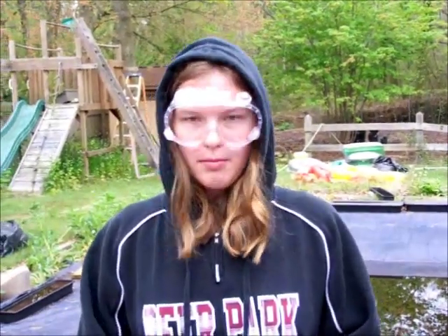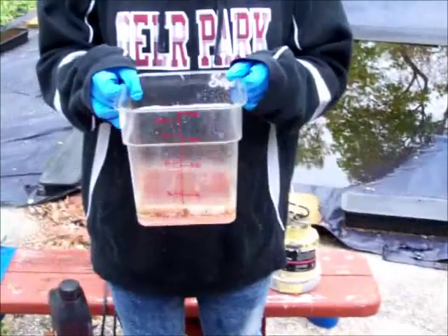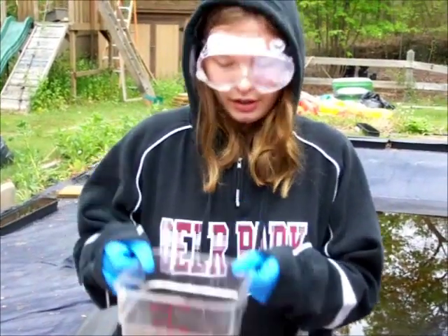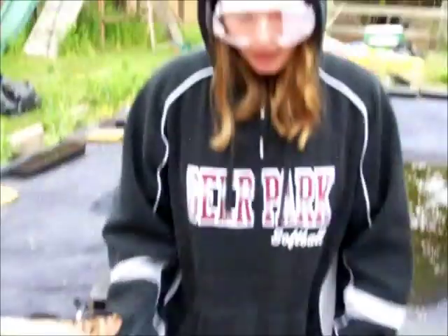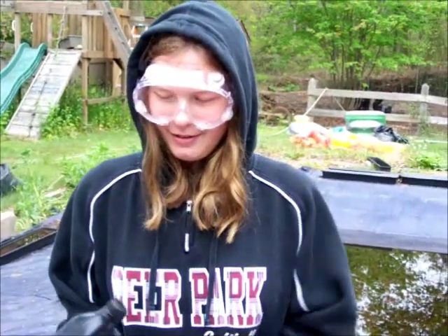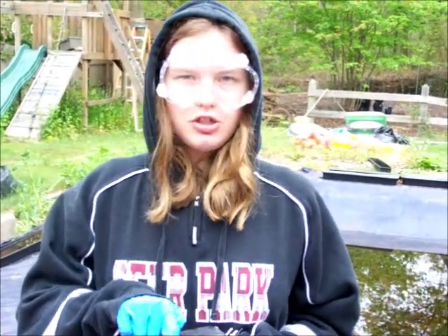For the purposes of this experiment, we're going to do it in reverse. Normally you would have the oil spill on top of the water table and then add Fenton's Reagent — our mixture of iron and hydrogen peroxide. However, instead, we're going to add our oil on top of Fenton's Reagent, because it just shows the reaction better. Which is what I'll do right now.